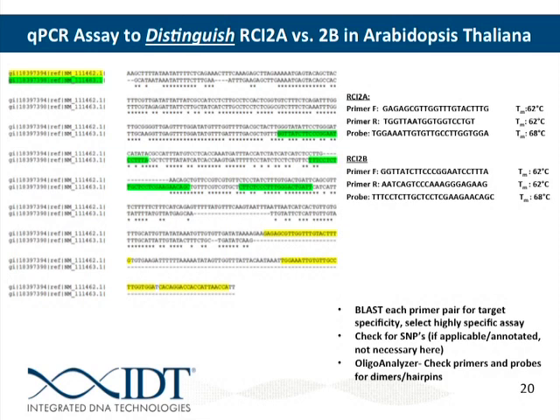In fact, I calculated it when I was putting this together. Is it on the next slide? No. I did calculate it, and it was so different that it actually said that the likelihood of that probe sitting on the off target was negative, which is a limitation of the thermodynamics program. But it's pretty convincing that that probe's not going to be able to lay down.